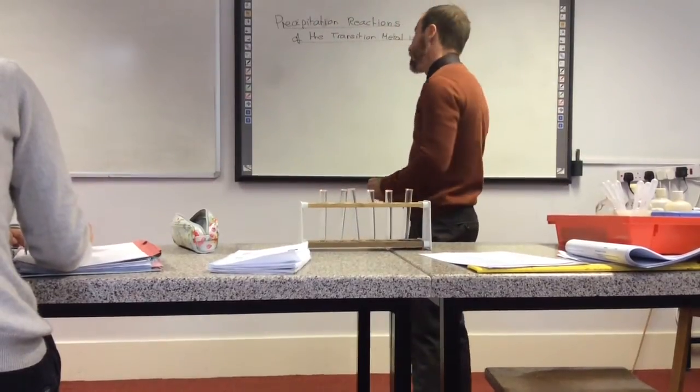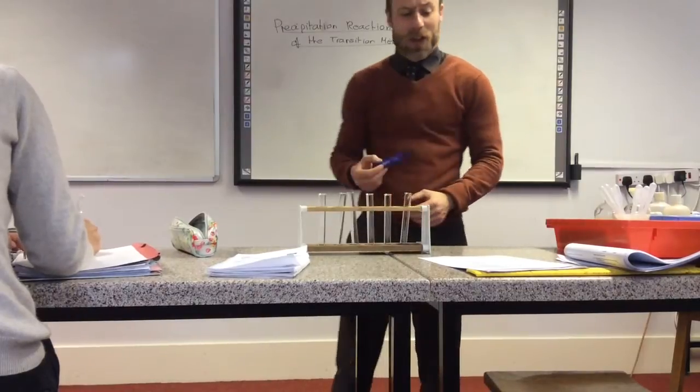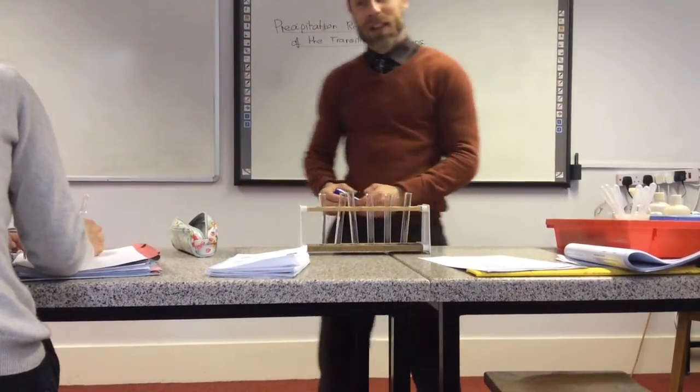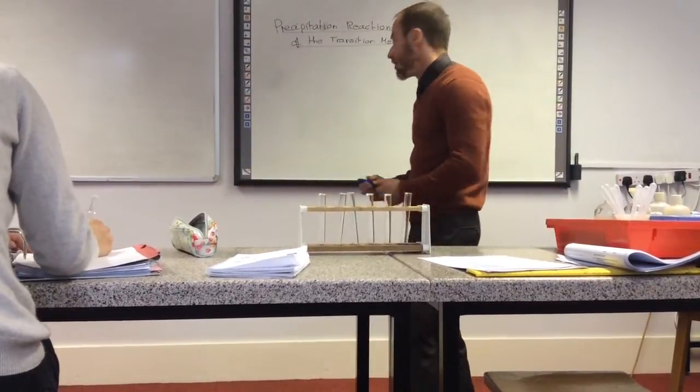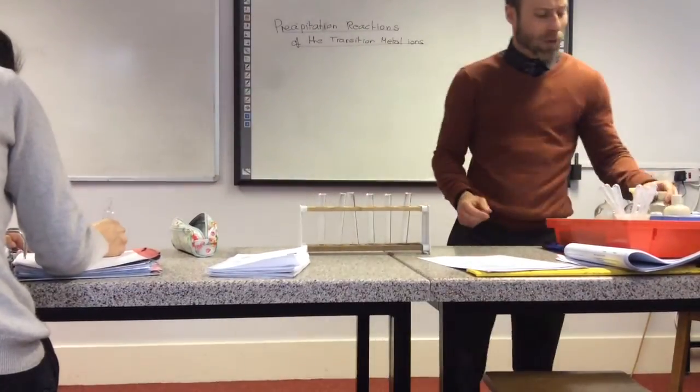We're going to do some transition metal reactions — precipitation reactions with sodium hydroxide. In the last lessons we did the equations, so we're going to start off with copper sulphate first of all.